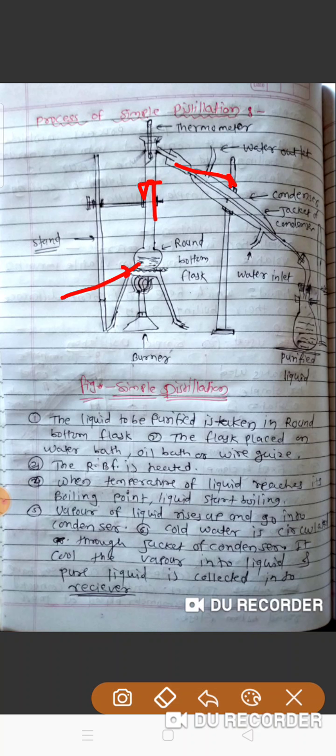The condenser is circulated by cold water, and due to this the vapor is cooled and condensed into liquid, and this purified liquid is collected in the receiver. So this is the process of simple distillation.